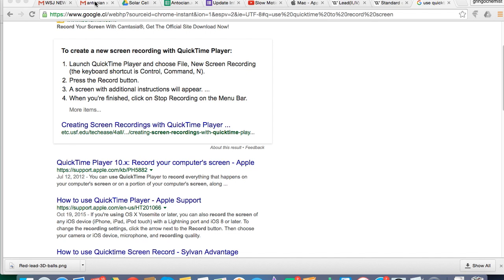Hey guys, wanted to go over how to get your HPLC data into Logger Pro so we can work it up here.